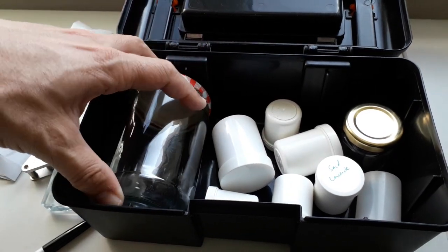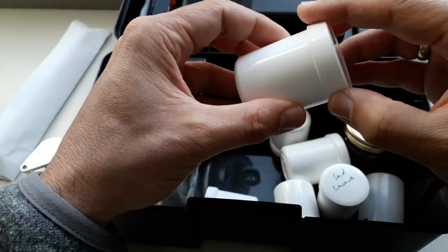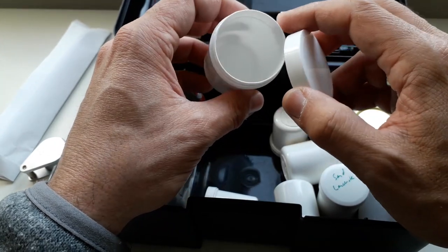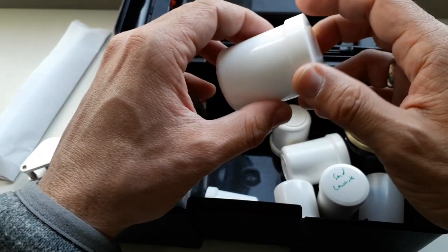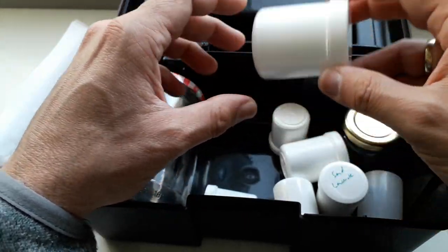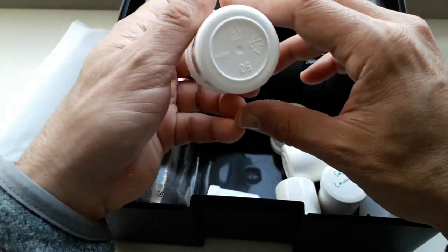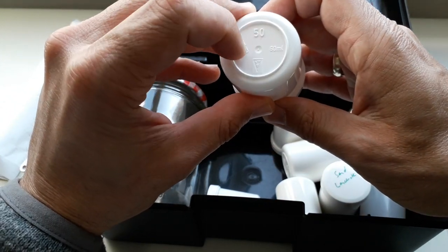But what I consider really useful are those plastic containers. Basically, I got them from a local drugstore because they use them to make creams, and then they fill it up in here, and then you can buy it. And they were ridiculously cheap, actually. And they're reusable and they're watertight. That's really an advantage. There are different volumes here. That's a 50 milliliter, for example. No, 60 milliliter. Okay.